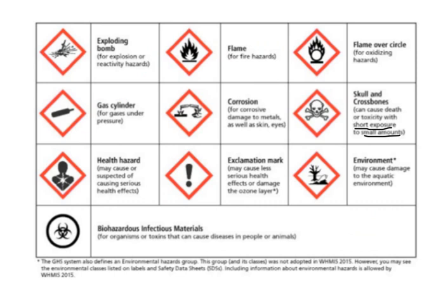Whereas this one right here, the health hazard, may cause or is suspected of causing health effects, but long term. These could be things that maybe cause cancer eventually, right? I would expect that maybe this should go on a carton of cigarettes because long term it's bad for your health. But if you smoke one cigarette, not that I ever say you should, are you going to immediately die? No. But if you smoked a pack a day every day for 20 years, yeah, you're probably getting lung cancer, right? So that's where this one would come in.